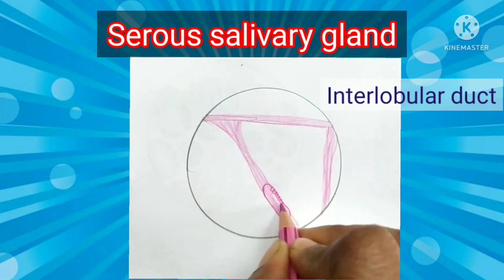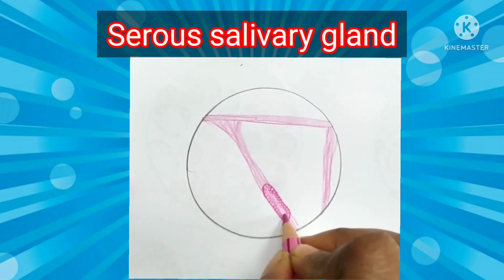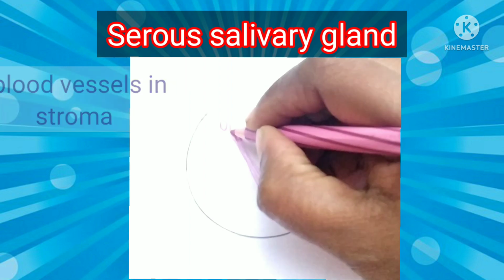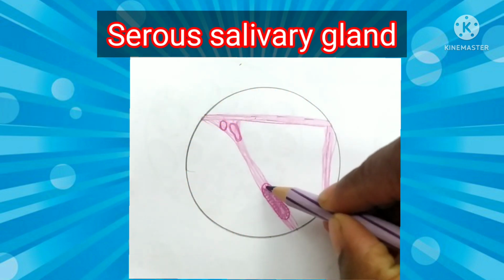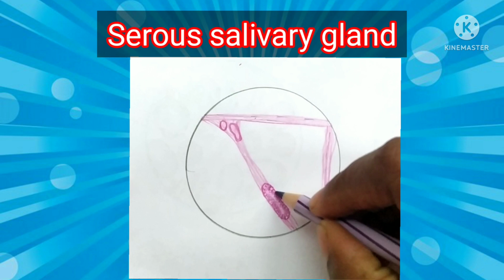We'll see the interlobular duct, the epithelium of which varies from tall columnar to stratified columnar, very close to the excretory duct. It depends on the size of the duct. So interlobular ducts are seen in the septa which separate the lobules. And also you see the major blood vessels which supply the gland.